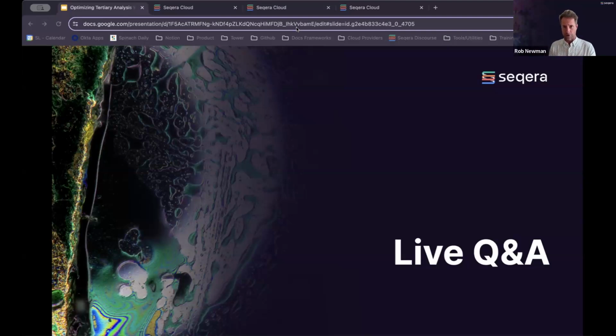So if you do have a graphical user interface like IGV, you can then create your own Data Studio session from that template image of X11, and then you will be able to have access to GUI applications like IGV.